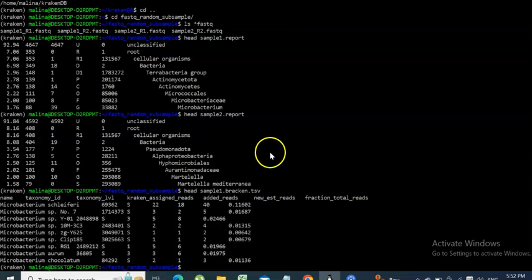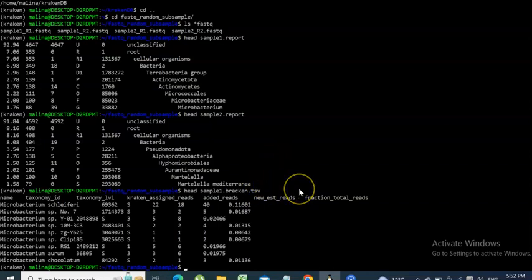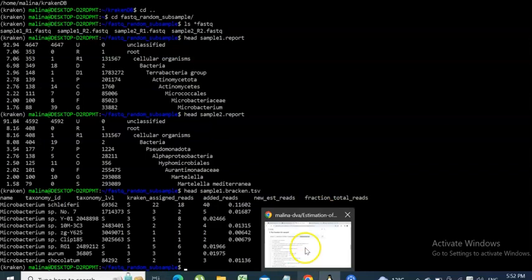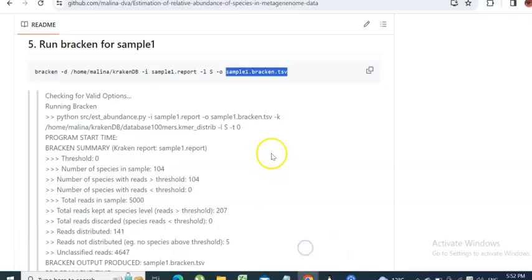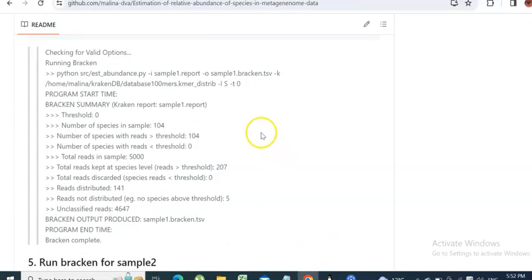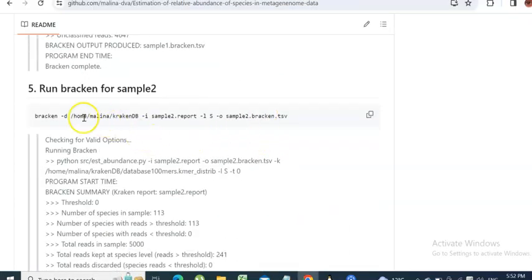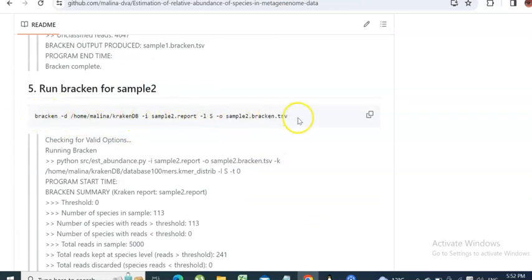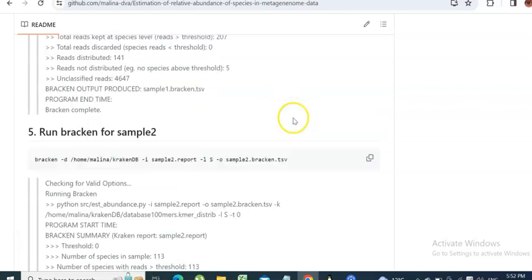We have this TSV table, which is great, but it is only for sample one. Bracken also has to be run for sample two. You need to copy and paste the command into your terminal again.